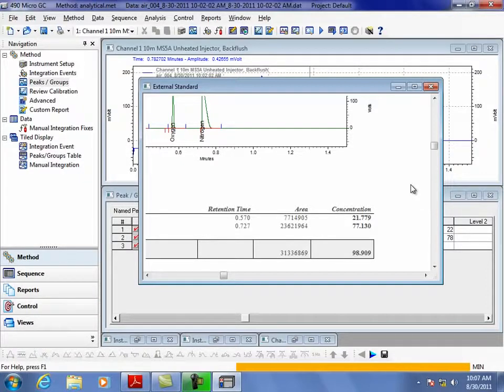If it's sitting there, it's eventually going to come to 42 psi and it's going to blow a hole in that injector. So you have to keep it below 15. And I don't know if yours even has pressure. I don't know how the process itself. No, not very high. Okay. Actually, the gasifier was a little bit of vacuum, not very high vacuum, a little bit of a vacuum.